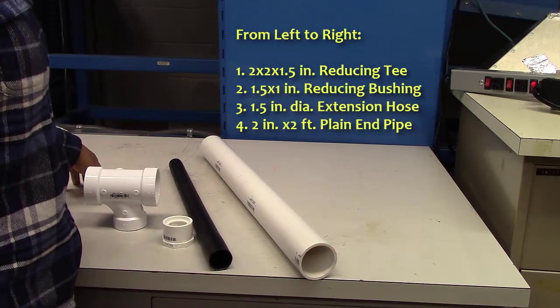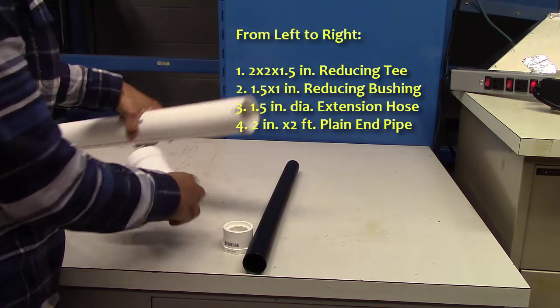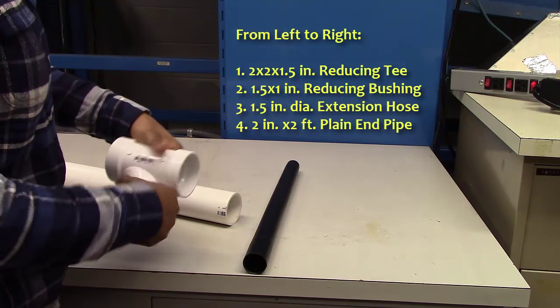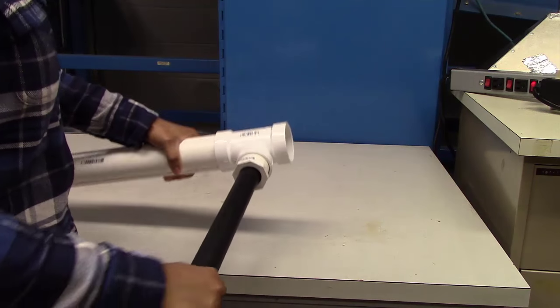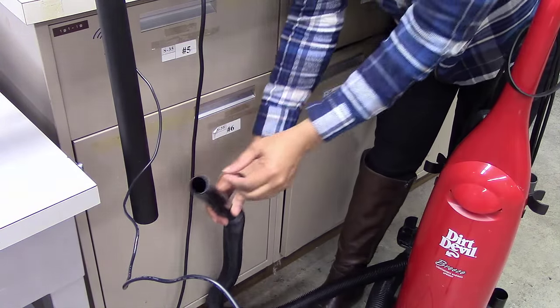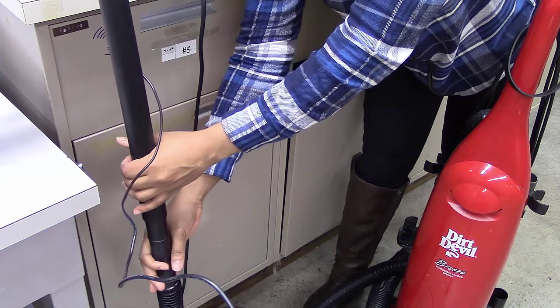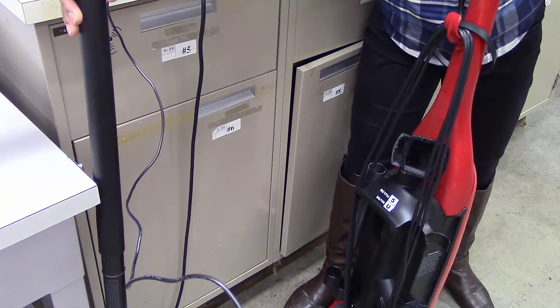First, let's create a setup that mimics a local exhaust ventilation system. To mimic a hood and conveying duct, plug the 1.5 inch diameter reducing bushing tightly into the 1.5 inch hub of the reducing T. Link the 2 inch diameter hub of the reducing T into the 2 inch diameter plain end pipe. Then, attach one end of the 1.5 inch diameter extension hose into the reducing bushing. Connect the other end of the extension hose to the vacuum cleaner. When switched on, the vacuum cleaner acts as the fan that moves the air, and the air velocity must be enough to move air into the hood and ducts.